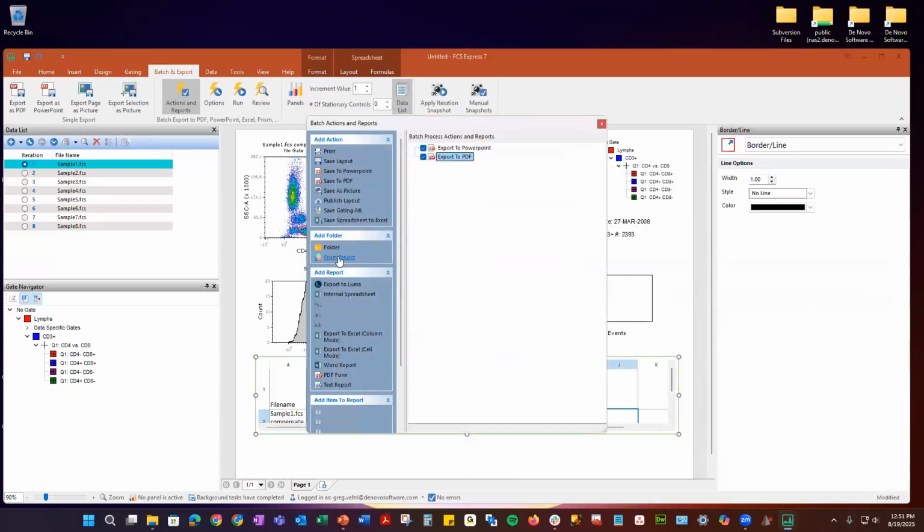Now, there are two things here. So I have a Prism and Luma. Now, the Prism is one of our family members of the Dotmatics, if you've worked with Prism, and you can export to Prism. We have a web page that goes through a bunch of tutorials on that. And if you'd like to have that link, you can ask us or you can email us at support.